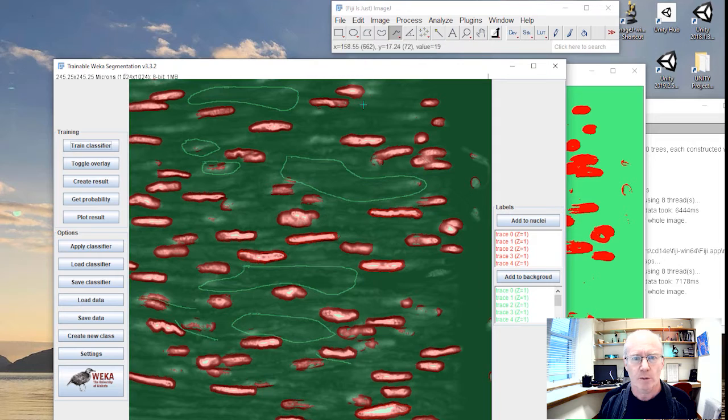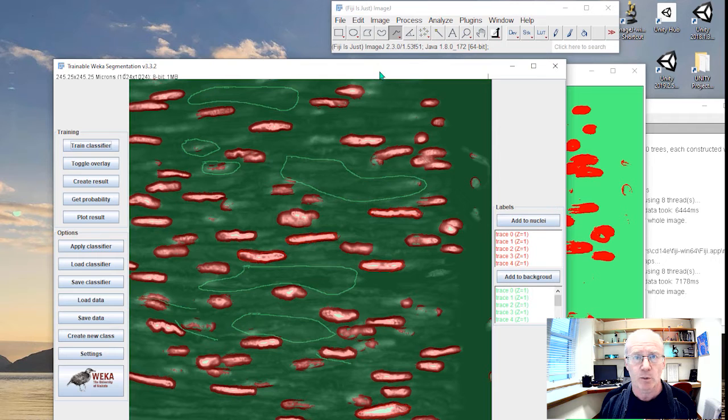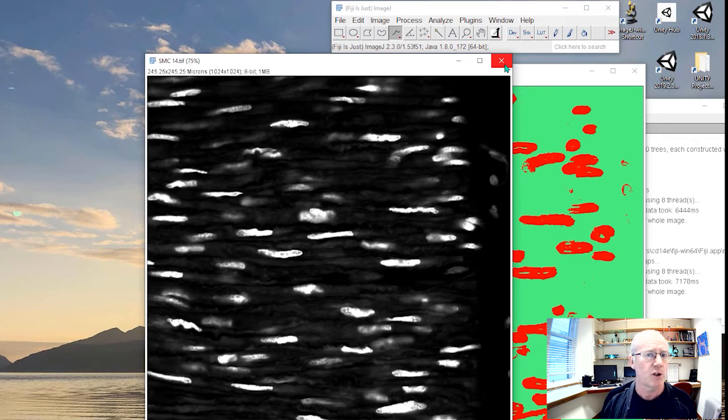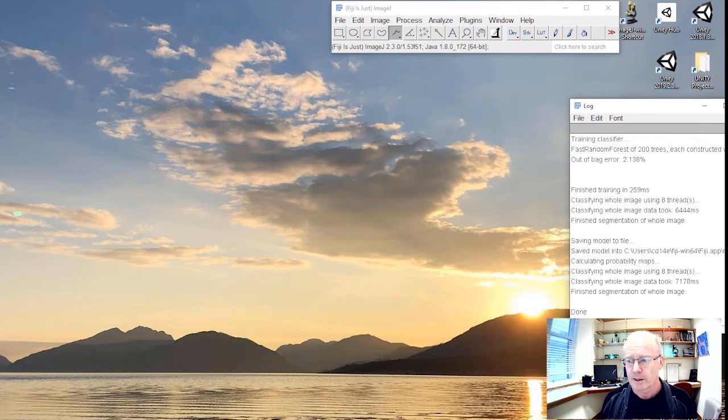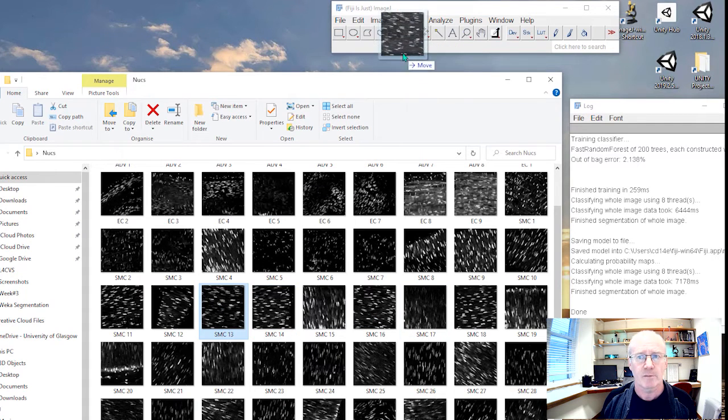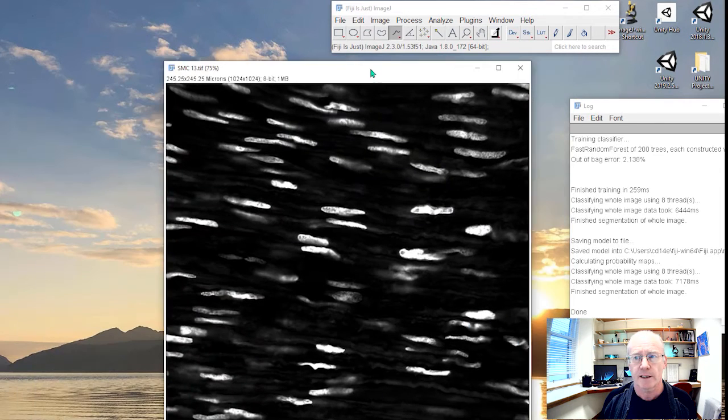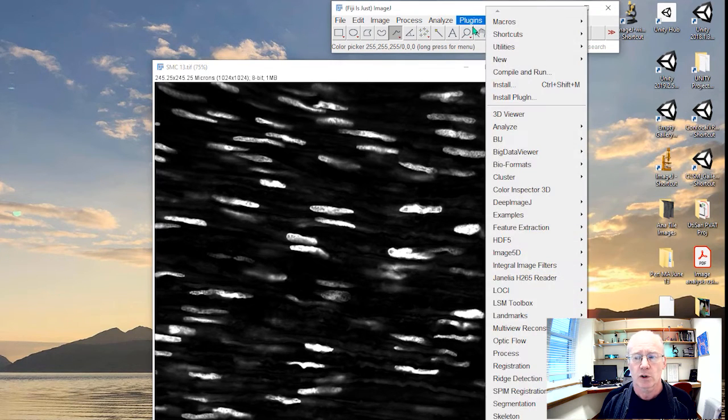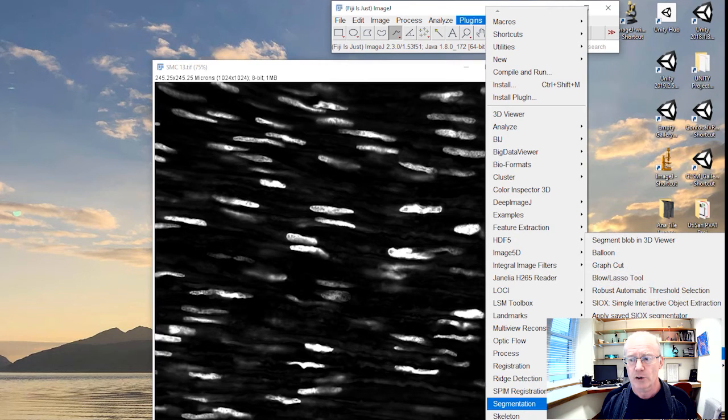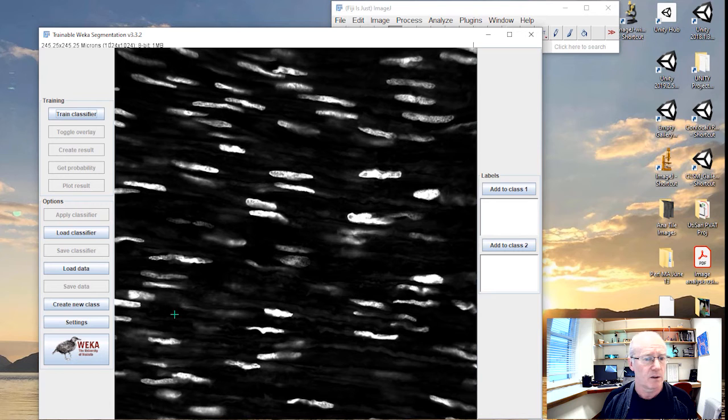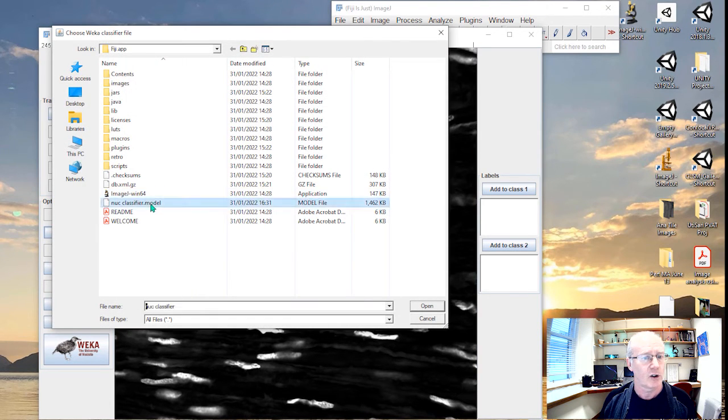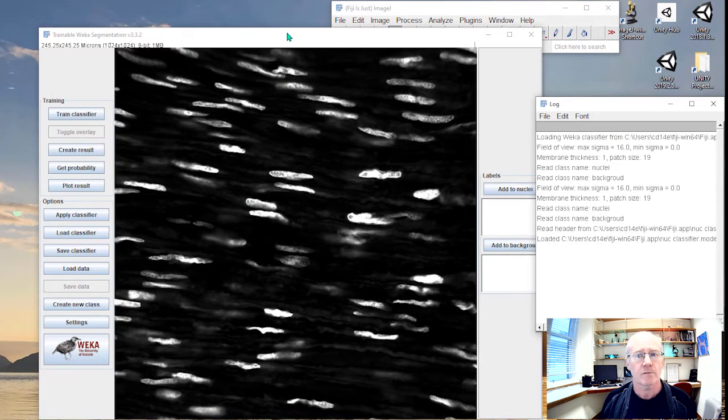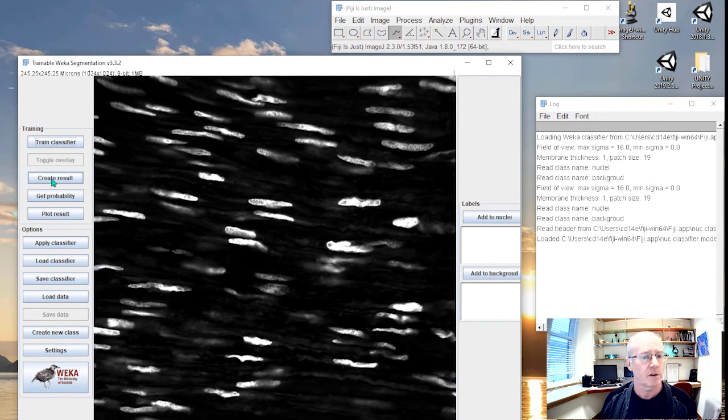So we've got our probability, we've got our result, but we want to apply this classifier that we've trained to a new image. So let's quit all this. We were on image 14, so we're not going to use that one again. Let me get another. Let's try image 13. So we've got image 13. Let's just get rid of the log for the moment. We'll go to segmentation, trainable Weka segmentation. And there we are. We can load a classifier. And there's our nuclear classifier model. Let's open that. And let's just create the result.